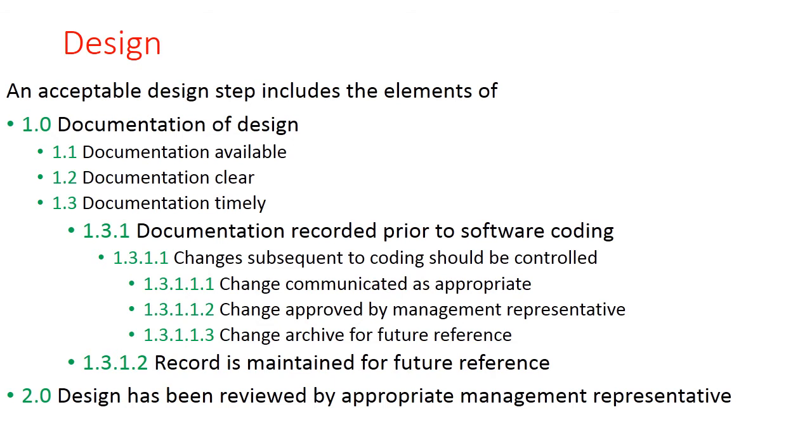Change communicated as appropriate. Each and every laboratory should develop a communication channel to communicate the need for such changes in approved documents, and the person who is seeking these changes must follow a proper communication channel in order to incorporate these changes in the approved standard operating procedure. Change approved by management representative. Once the changes are approved by the management representative, we can incorporate them into our final standard operating procedure.